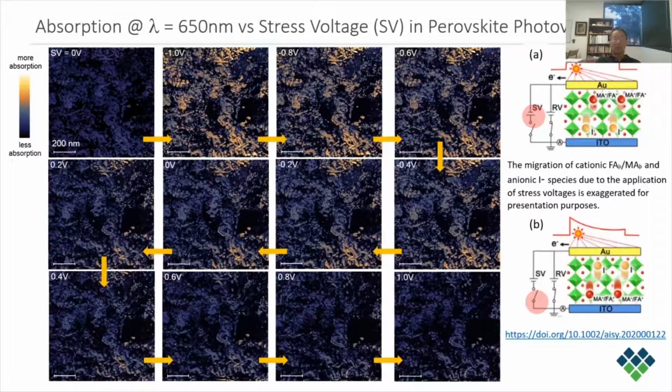Consequently, some ions drift back into the deeper region under concentration gradient, leading to a decrease in both the PiFM signal intensity and absorption areas. These are shown in PiFM images 2 through 7.